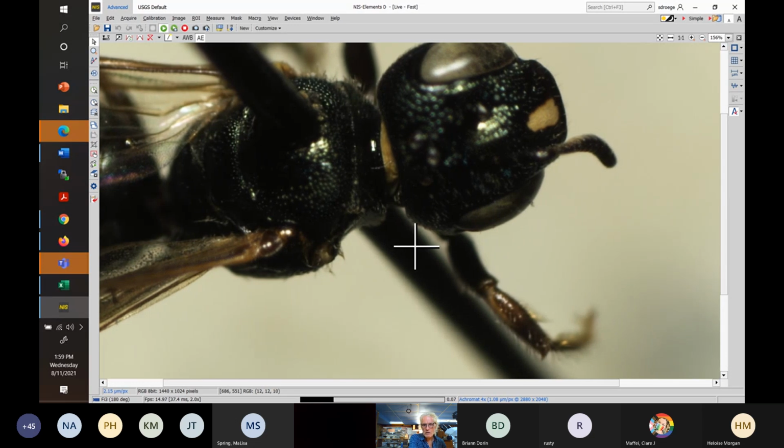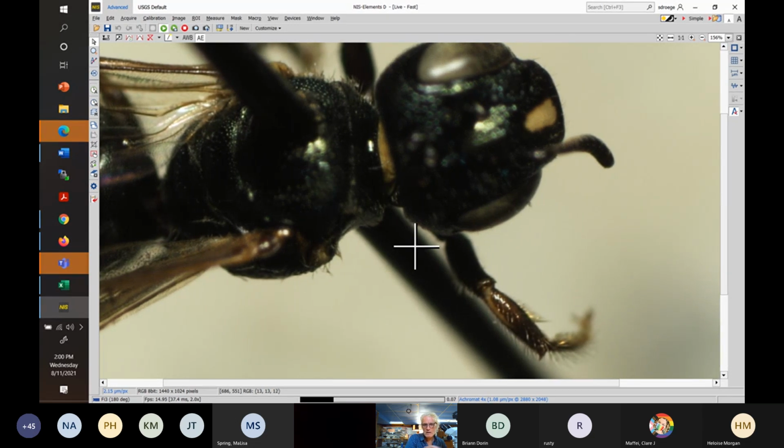But when you're wondering, is it dupla or is it Strenua, you might have a sense of that because this would be small, but this tells you, that white stripe. Now, because they're bees, sometimes this white line can be faded. I would call it faded. It's not probably really faded, but it can be difficult to see. It seems to blend into the integument more. You have to look back and forth. You might also call some of these Ceratina species also.